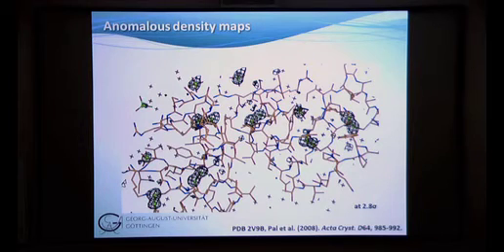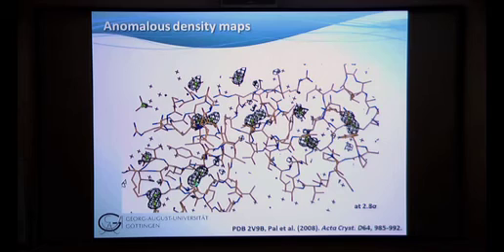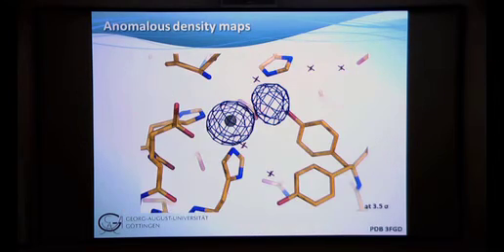That's true. So actually I looked at the data and I thought it's possibly only partly occupied, or it's some ion. But it's not a fully occupied sulfate, although it has been refined as such. So doing this can possibly confirm things you have done in refinement and help you actually to confirm all the positions of the disulfide bridges as well.